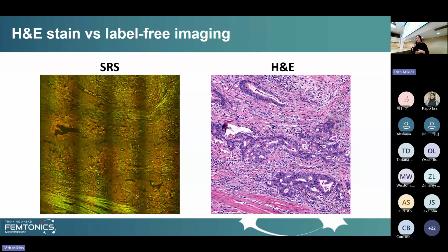But here I have to tell you that this project started at the company during the COVID era, which meant it was really impossible to get fresh or frozen samples, but the project had to go on. So we decided to go on with fixed, deparaffinized samples. That's why we had to measure these samples at uncommon wave numbers.